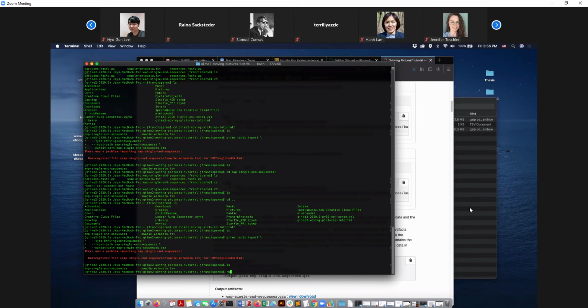Yeah, just start over and see if that fixes it. That's the right command, right? You're going to do remove, and then after remove, you're going to put a -rf. Is it capital R? No, all lowercase. Just R. What that does is it'll delete the folder and everything in it.